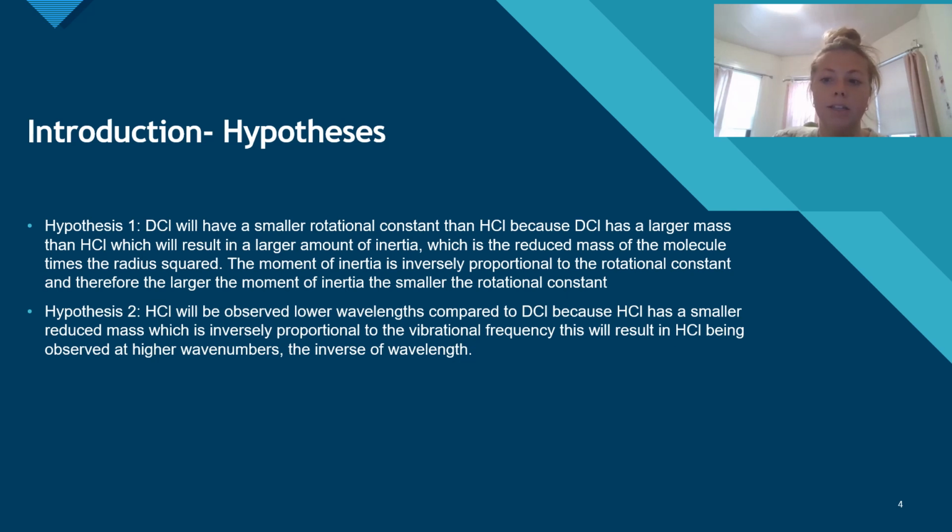My second hypothesis is that HCl will be observed at lower wavelengths compared to DCl. Because HCl has a smaller reduced mass, which is inversely proportional to the vibrational frequency, this will result in HCl being observed at higher wave numbers, which is the inverse of wavelengths.